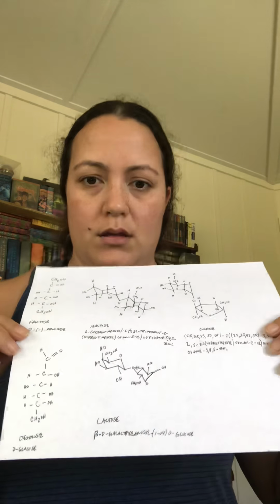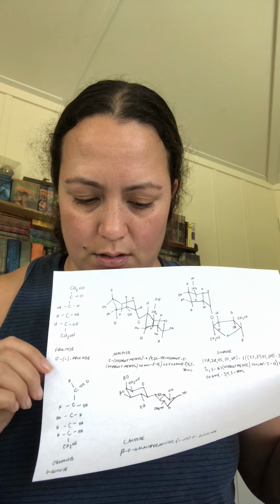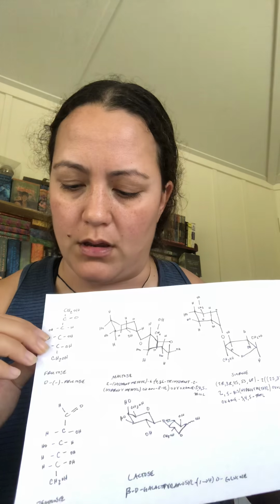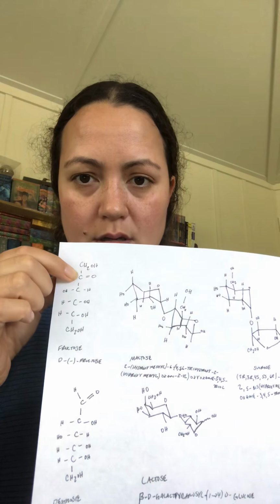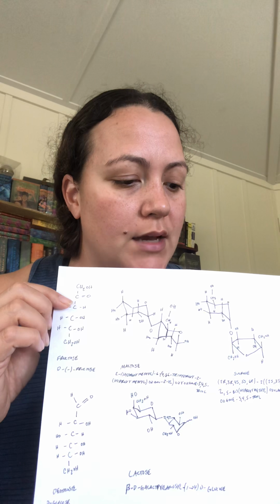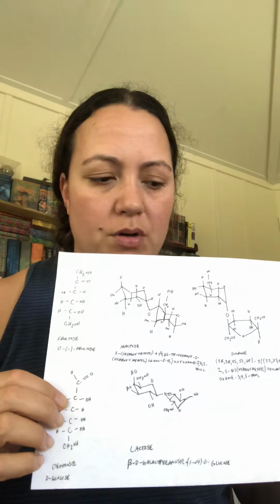Because we know what that looks like, in my hand-drawn compounds here with IUPAC names, the clearest ones to see are fructose and dextrose, because those had the strongest reaction. So I can point them out here. In fructose, you can see the double bond between the carbon and the oxygen, and then that carbon is connected to two other carbons, here and here. So that would be a ketone, and that's why we got such a strong reaction.